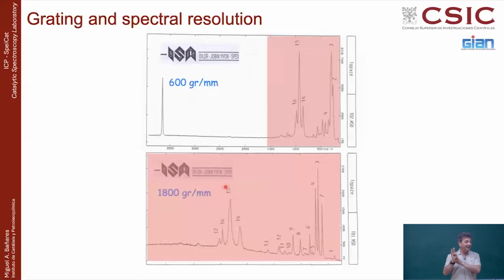Then the telephones came with this idea of the panorama, where you make a sweeping motion. So the same CCD is recording everything, synchronized with your movement. Now, you think that this was an idea of the telephones? No, that was used in Raman spectroscopy. They can do things like the grating moving continuously, synchronized with the detector. So you can get more resolution and get everything, just the same way that you make a panorama photo with your telephone.